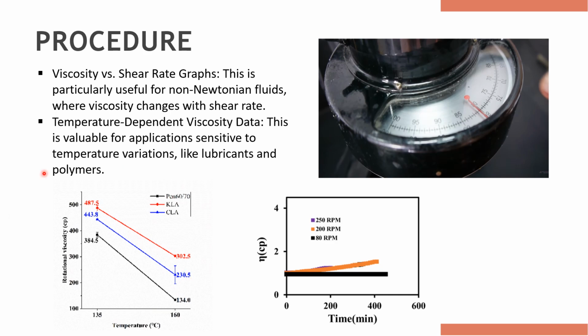So here you can see a graph. This graph represents rotational viscosity in terms of temperature. This graph is for polymers. Here you can see that the black line represents the polymer called Pen 60/70, the red line represents KLA and the blue line represents CLA. So here you can say that at a temperature of 135 degrees Celsius, all elements have a higher rotational viscosity compared to the temperature at 160 degrees Celsius.